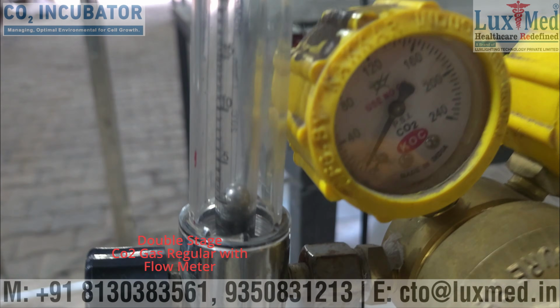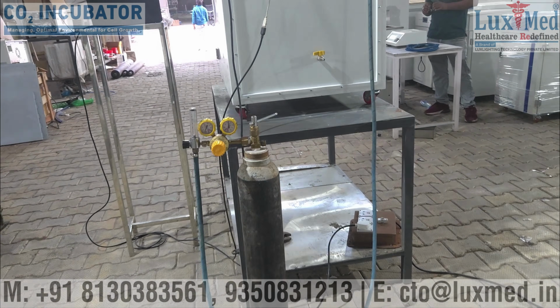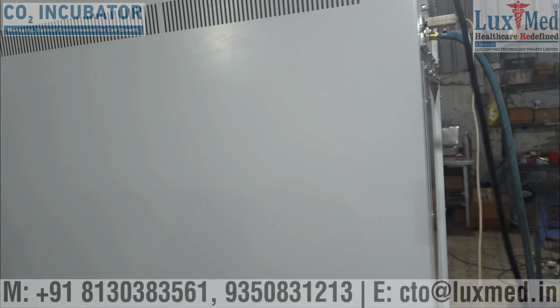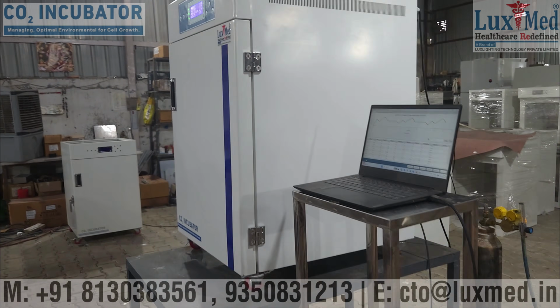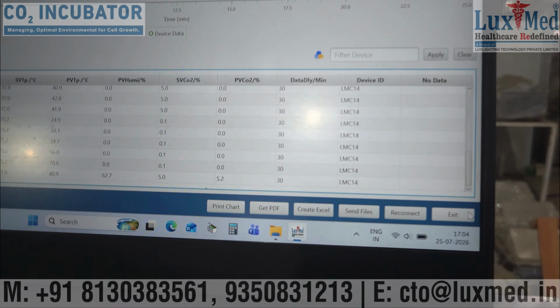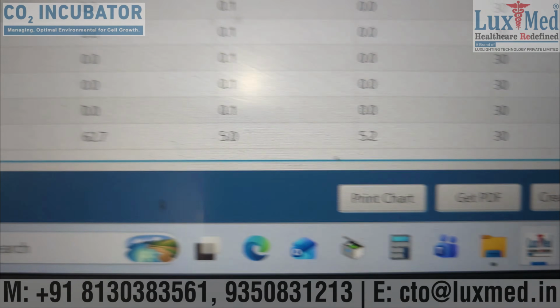Vaccine and antibody production. They play a role in the production of cell-based products like vaccines and antibodies, which are crucial in the pharmaceutical industry. Diagnostics. CO₂ incubators are used for diagnostics, such as cell-based assays and monitoring cell growth in various applications.